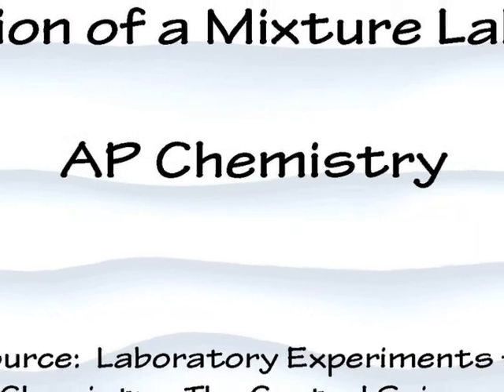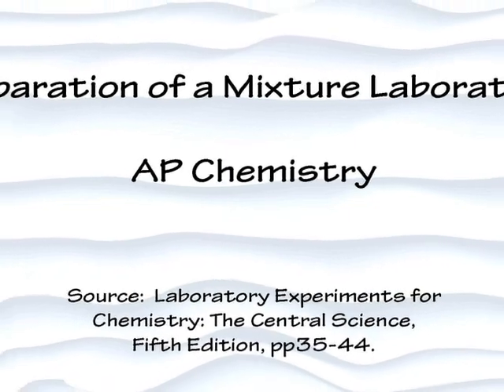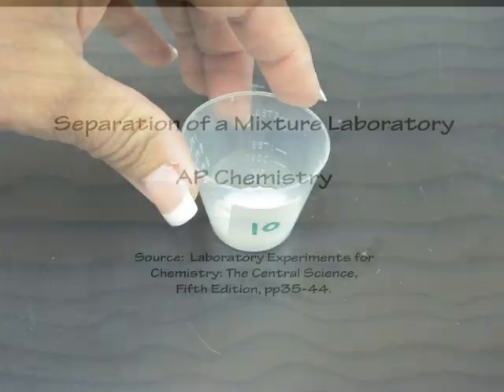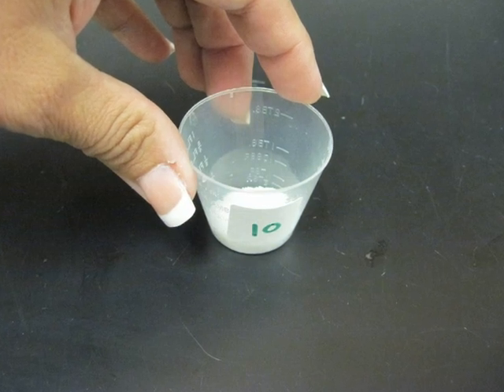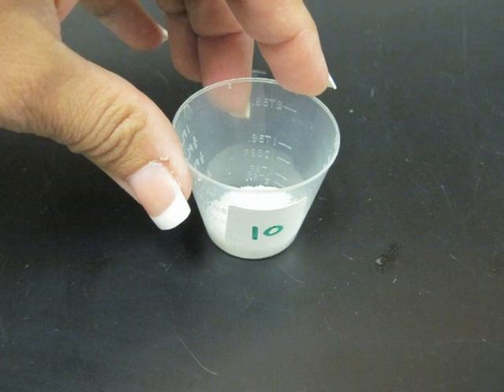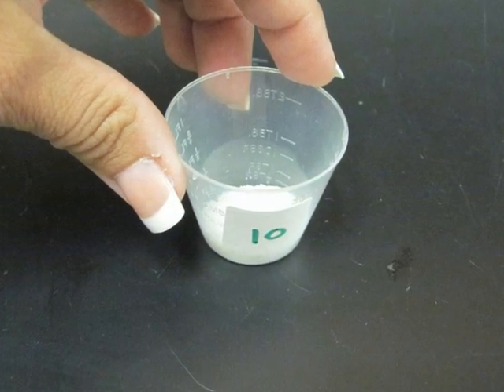This is an overview of the separation of a mixture laboratory from the Advanced Placement Chemistry course at Hempfield Area High School. Obtain an unknown sample. The sample will contain ammonium chloride, sodium chloride, and silicon dioxide. Be sure to record your unknown number in your data table.